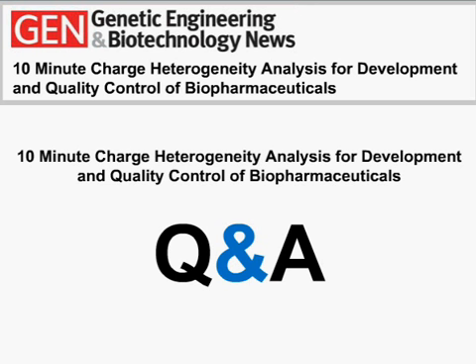Thank you, Scott. And does imaged CE offer any advantages over CIEF, the iCIEF method from Beckman? Yeah, that's kind of like asking me about my child being ugly. I have experience with both methods. I did most of the development for the Beckman method while I was at Beckman. The biggest advantage that you run into is the elimination of the mobilization step. It significantly truncates the analysis, which allows for much higher throughput. And it also eliminates the effects of chemical mobilization.